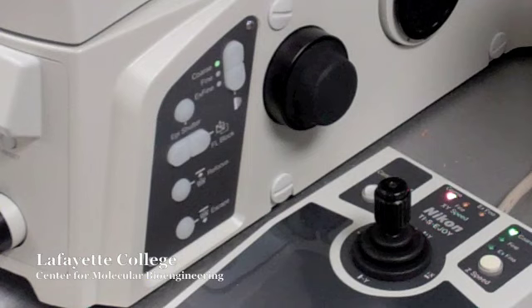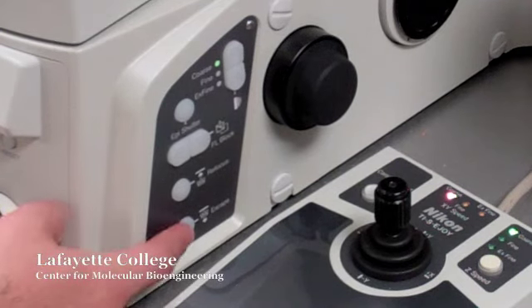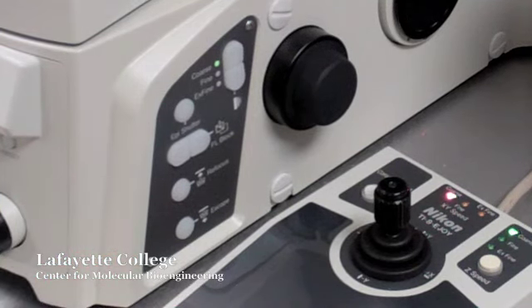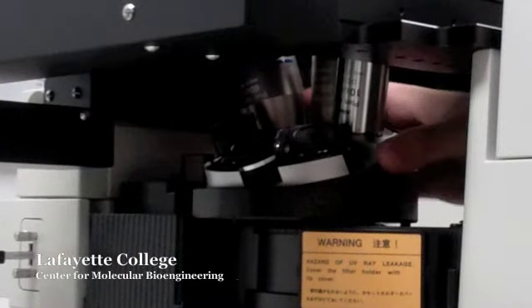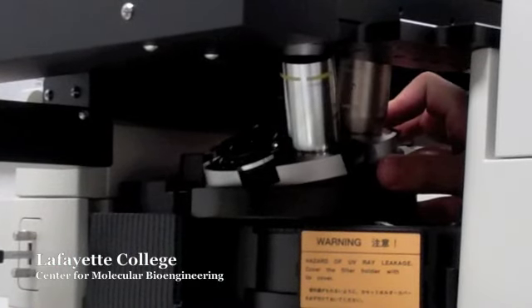To change between 10x, 20x, and 60x objectives, first press ESC to lower the nosepiece. You can manually select your objective by using the rotator beneath the stage.